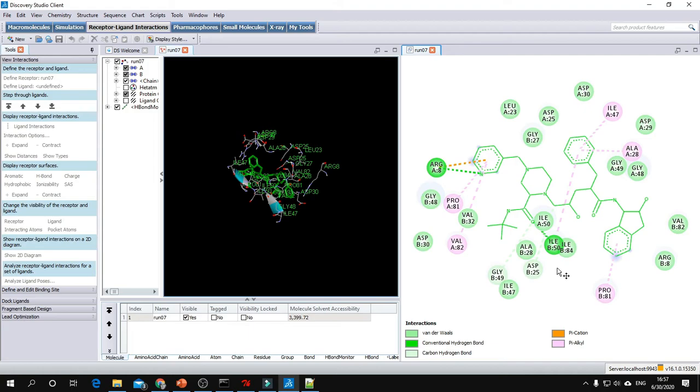To compare between the two complexes, you have to report and compare the lowest binding energy, the number of interactions, and the surrounding amino acids.